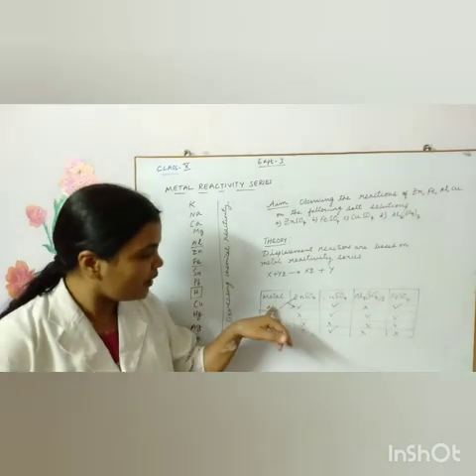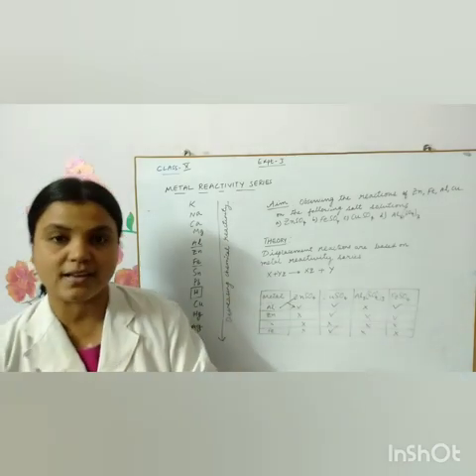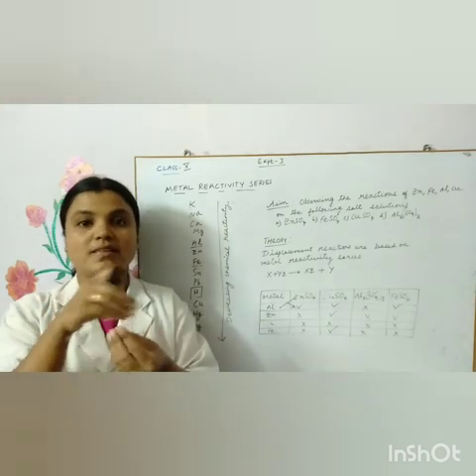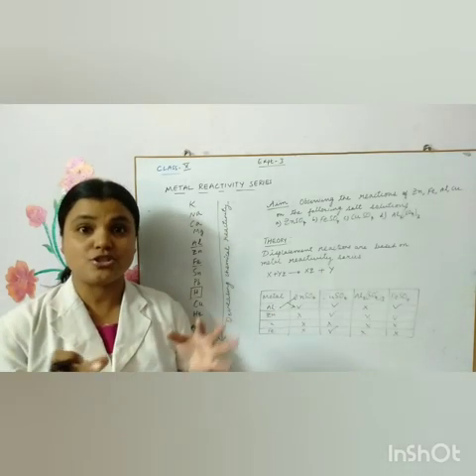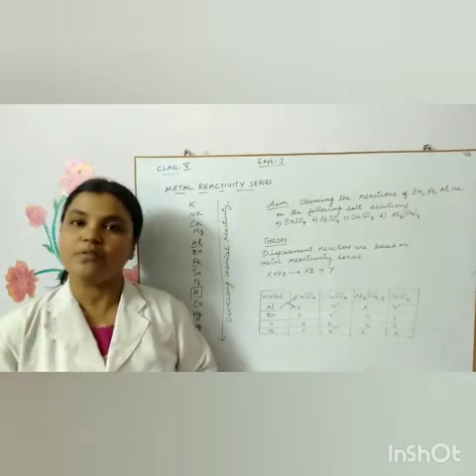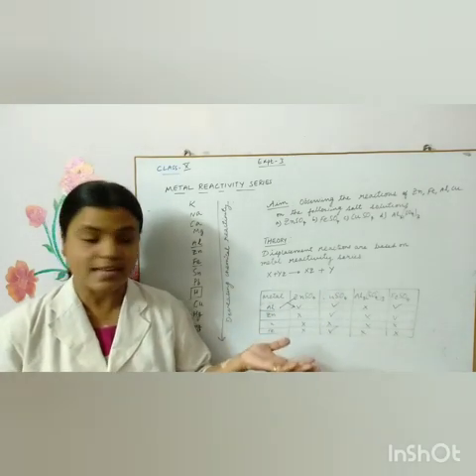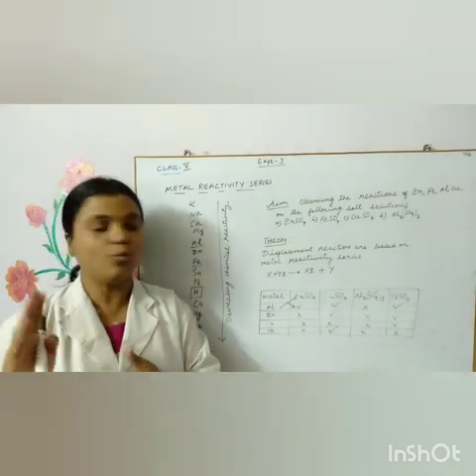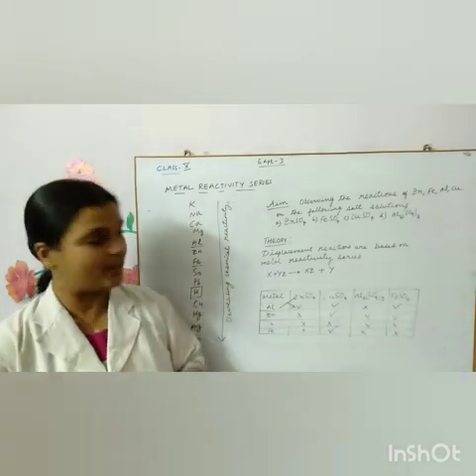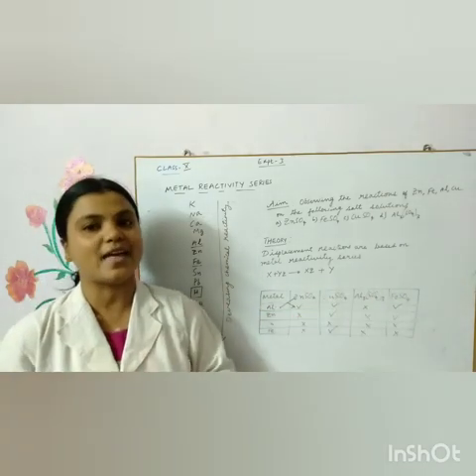So did you see, aluminium could react with zinc sulfate and displace zinc. That displaced zinc formed a coating deposited over the aluminium particles, which shows that aluminium is more reactive than zinc. The same thing happened with copper sulfate solution also. Here the blue copper sulfate got decolorized, which shows that copper is removed from its salt solution. And when will that happen? When aluminium is more reactive than copper. So it gave a positive reaction over here, showing that aluminium is more reactive than copper too.